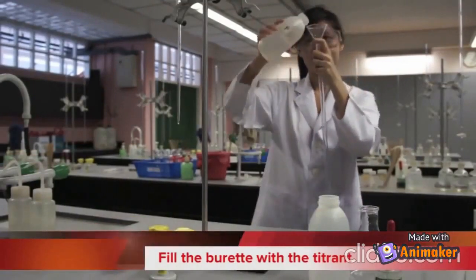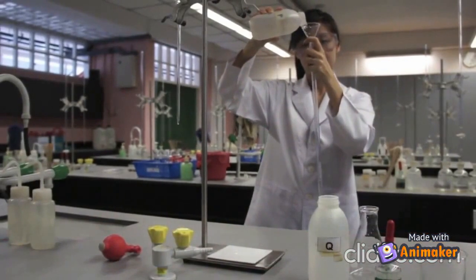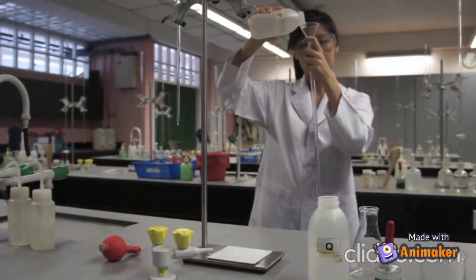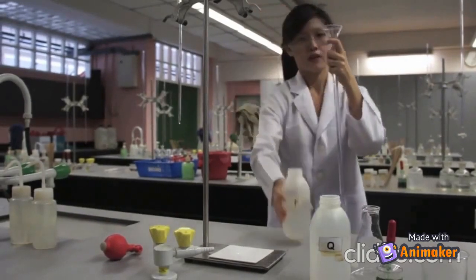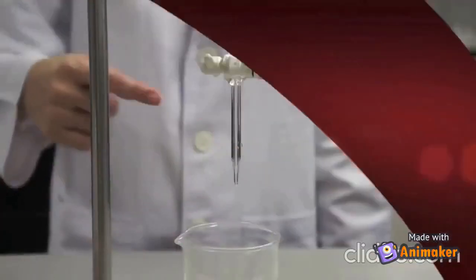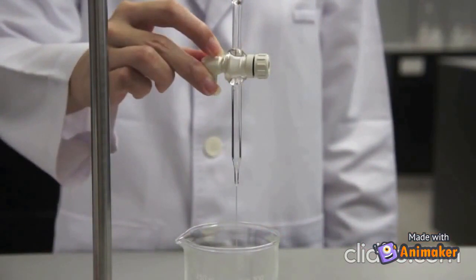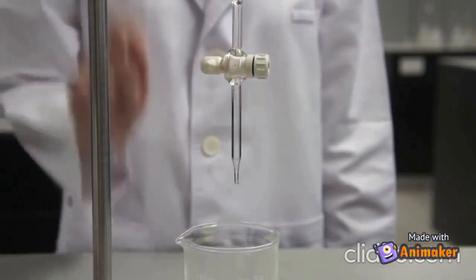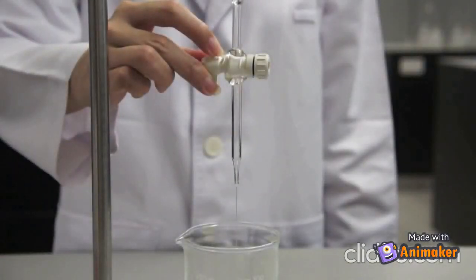Now you are ready to fill the burette with the titrant. Pour the titrant in from the top using the funnel. Now you need to release the bubbles from the tip of the burette. Do this by opening the tap all of the way and letting the solution push the bubbles out. Let's see this again in slow motion. Watch the bubbles closely as they come out of the burette. Now we are ready to begin.